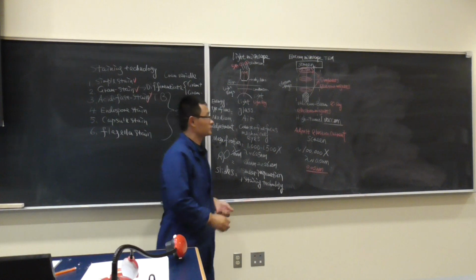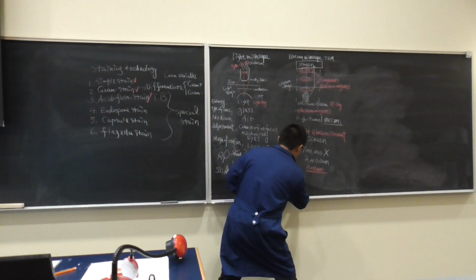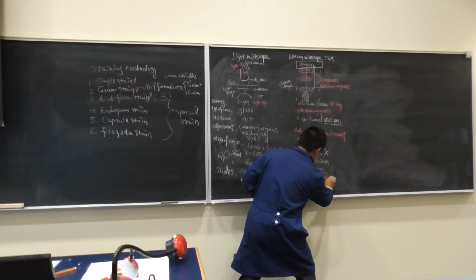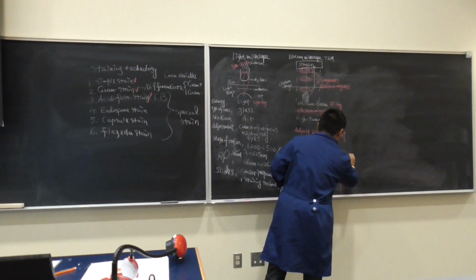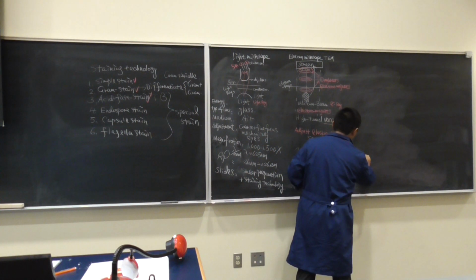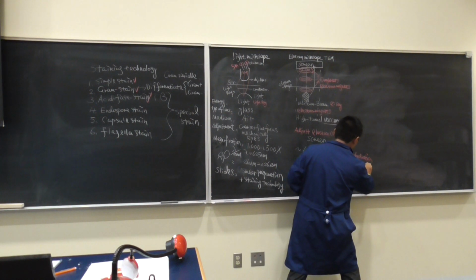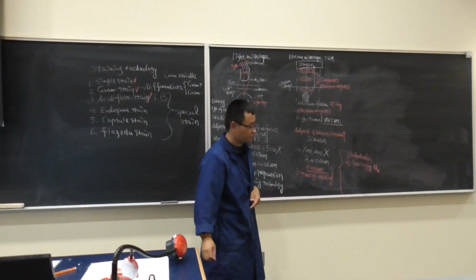But how about the electron microscope? It's not the same thing. It's a step a little bit complicated. We call it a freezing etching process. So usually what they have are multiple steps. Number one, the sample you have to do dehydration. Take out all the water. And the second thing is that we have to do a very fast freeze drying. How we do the freeze drying is liquid nitrogen, to do a deep freeze drying.